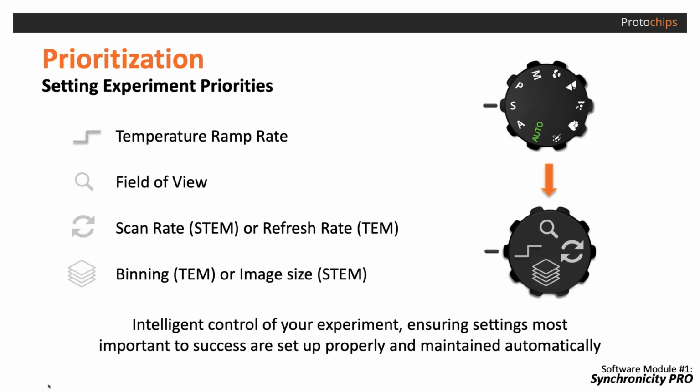With our products, AXON will also feed back to the Protochips holder system recommendations on settings. So for example, if it was that heating experiment that I showed you a little while ago, if we looked at the Fusion Select display, you would notice that it was also reporting a recommended maximum ramp rate. It's the AXON conclusion that that rate or slower would be a safe rate considering the way the sample was responding, so that we would never lose control of the sample.